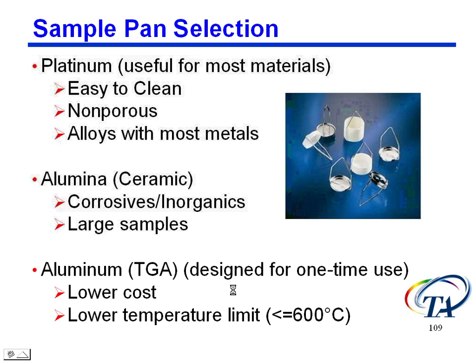Recently I was cleaning a pan with a sample torch and there were some pans mixed, and one of them was an aluminum pan. And so when I hit it with the torch, it melted in my tweezers, and I didn't have a pan anymore.